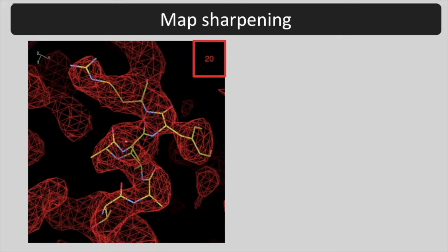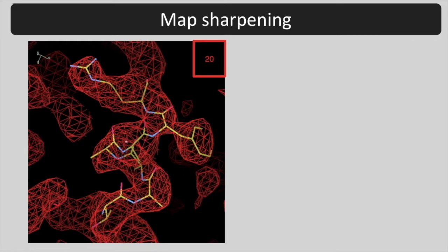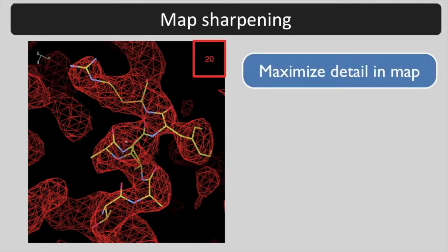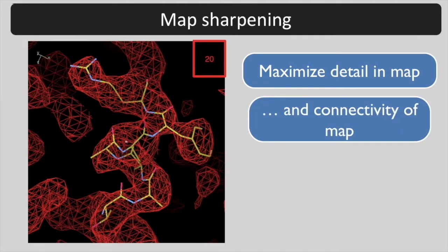Notice that the map is most interpretable when the B iso value is about 20 in this case. Phoenix AutoSharpen is going to automatically choose the sharpening of the map that leads to the highest level of detail while maintaining the connectivity of the map.